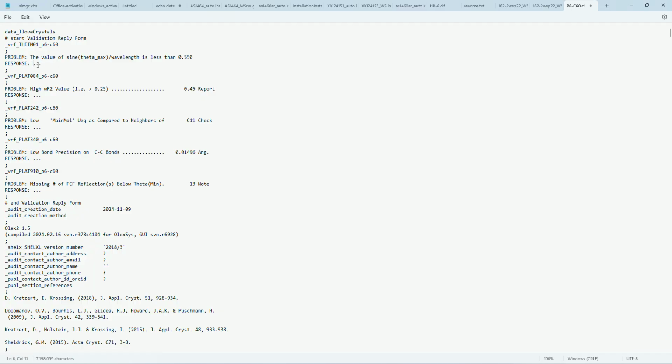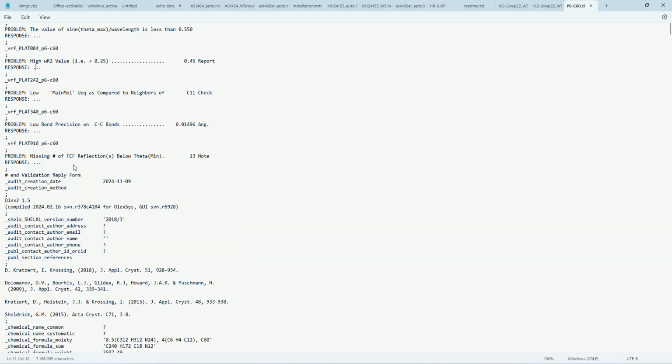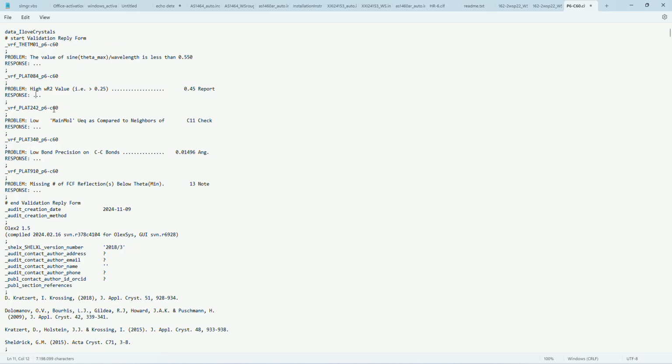So I think it's just important to not have too many letters in one line. I would say up to this point, if you write, everything will be okay. But if you write a very, very long line, up to somewhere there on the right, it might get cut from your CheckCIF PDF and it will not look great. So try not to go further than somewhere there. But yeah, just explain it. And then copy, save, and you can submit it to CheckCIF again and upload a nice PDF.